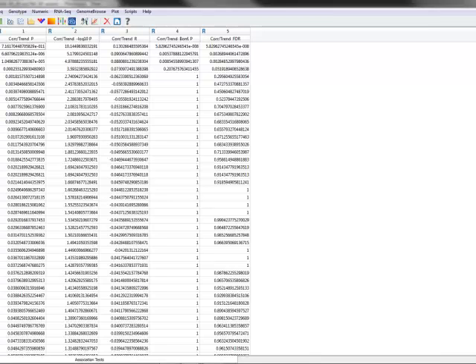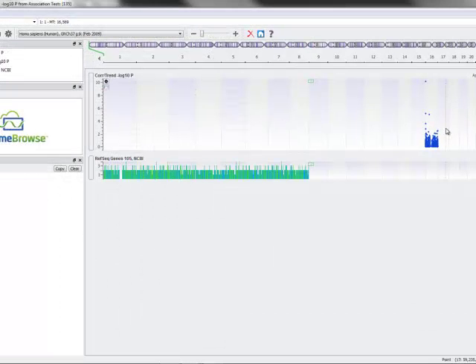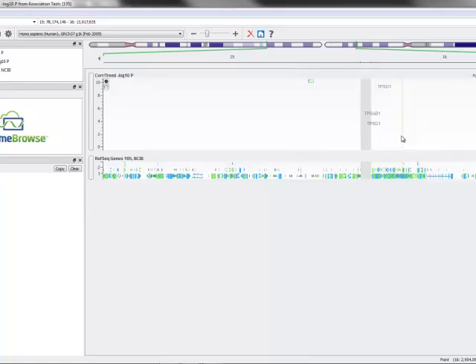It looks like all of these first 4 were part of the simulation that we looked at a few minutes ago in the slides. But I can see exactly what the significance level was there. And if I want to go a step beyond and look at it visually, SVS makes it easy to simply click, put the p-values into the browser where I can see the gene by gene p-values.